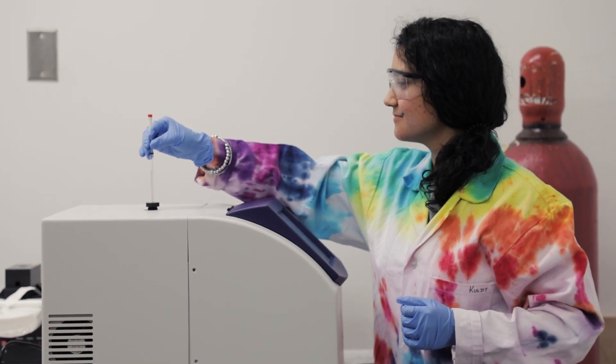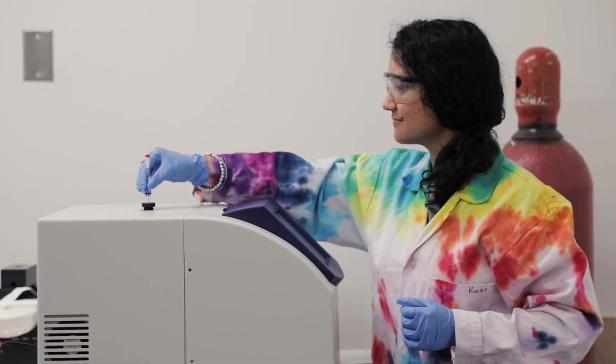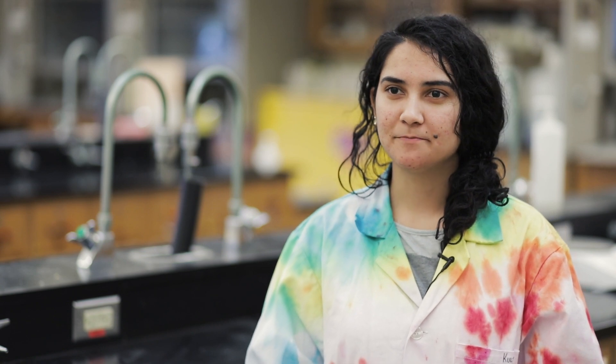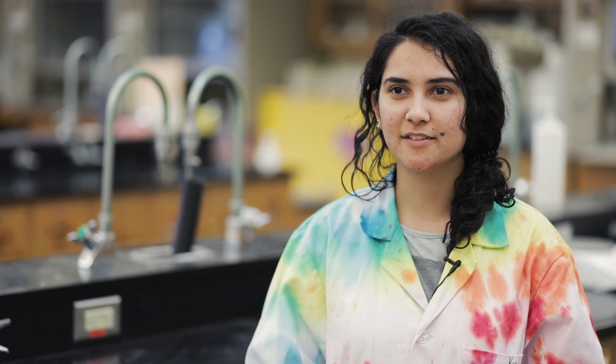The instruments are pretty straightforward to use. It just has a couple of steps that needs to be followed like placing the NMR tubes into the compartments and tweaking around with the software and just using it.